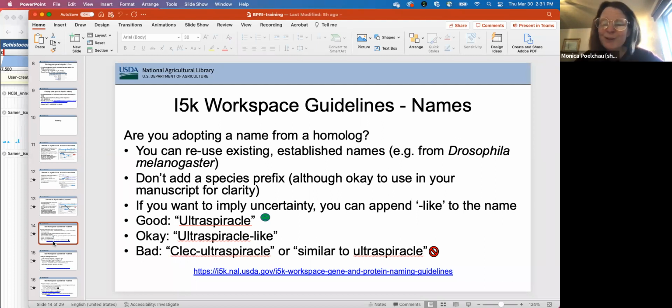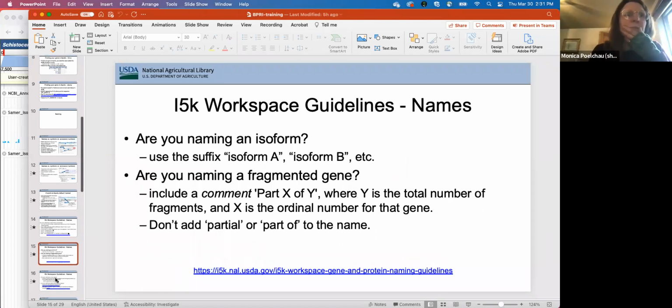In terms of if there's not a defined schema or defined way to do that for a gene family, you can make one up, I guess. You might want to do that append-like thing, but if it's necessary for you, and for your research purposes you do need to start keeping track of the numbers, then, do I have this in here?